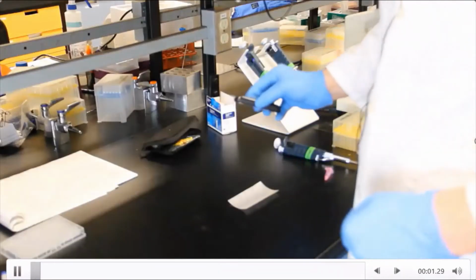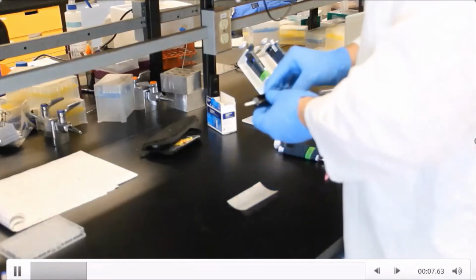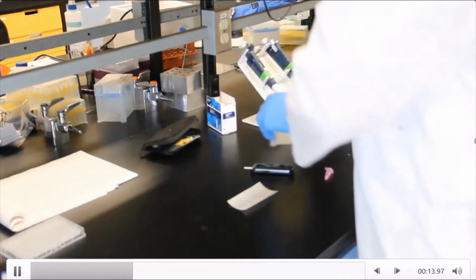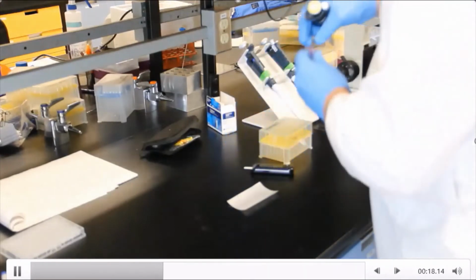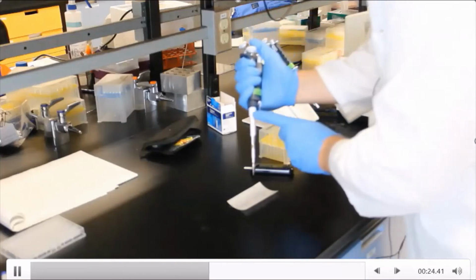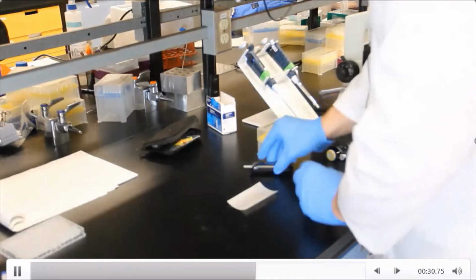So at this point, we're going to read our glucose concentrations with the glucometer. Once again, we need to go through our standard curve with the glucometer first before we get into our infected and uninfected cells. So what we're going to do is take our P20 pipette, get a small amount of our dilution, then place a dot on a sheet of parafilm so it forms a nice round ball for us to actually use.